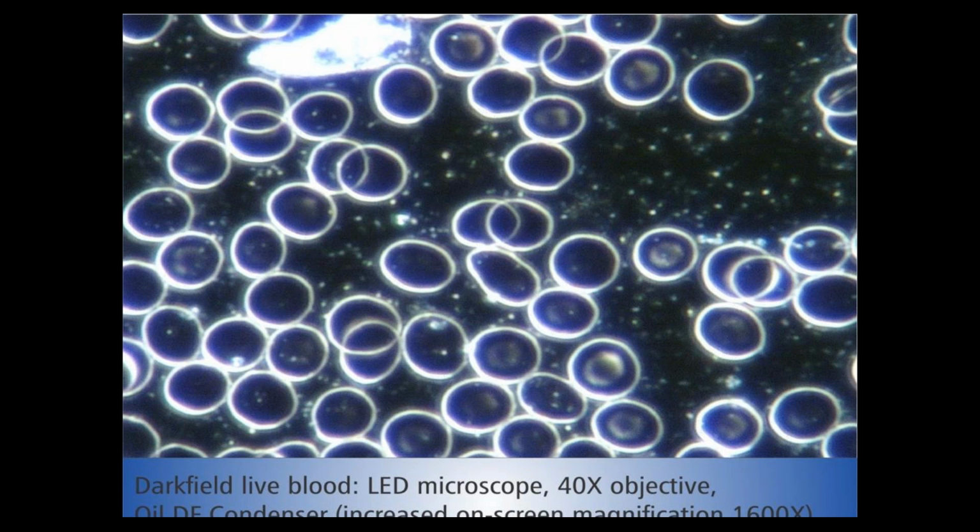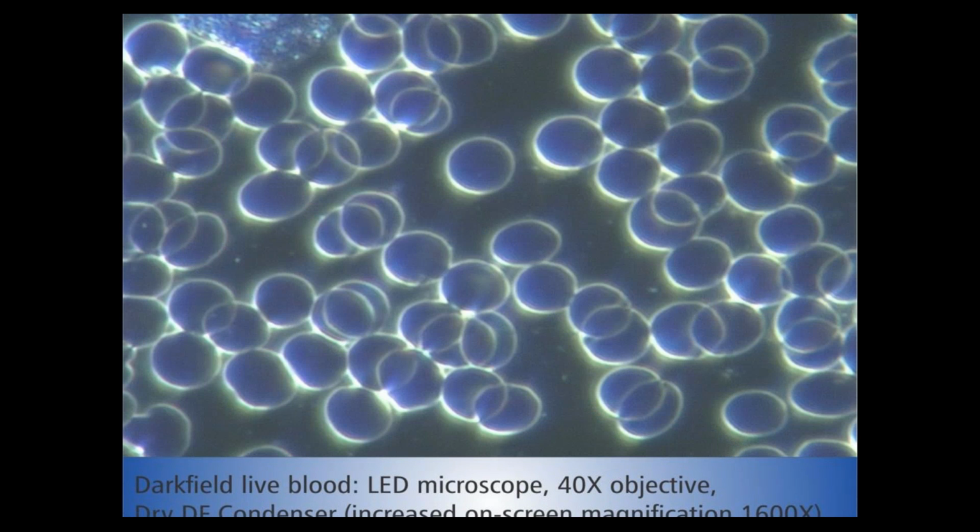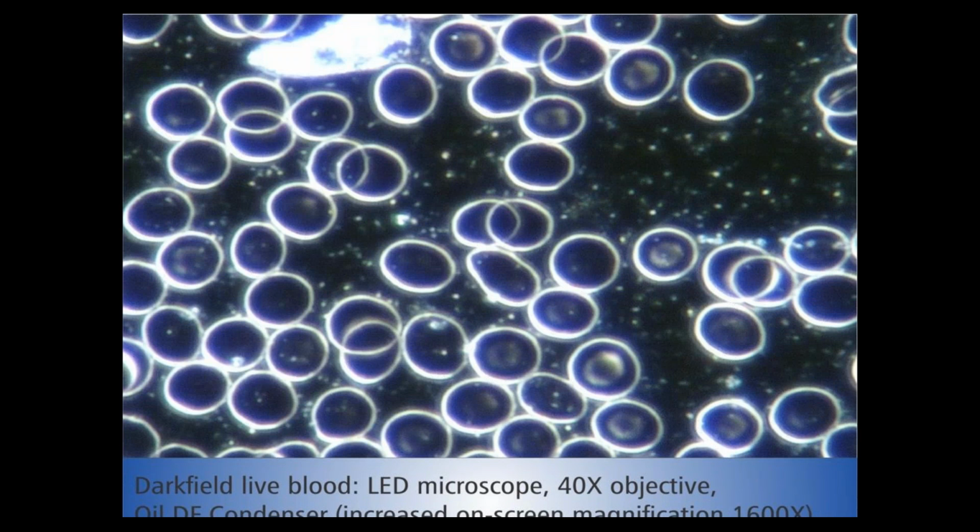And you can see with the dry dark field condenser, you're really not able to see much detail between and inside the cells. As I said earlier, this is the same blood sample, and you can clearly see that with the dry condenser we can't really see any of the target cells or many of the chylomicrons, whereas with the oil immersion condenser we can actually see target cells and chylomicrons all very clearly visible. Now, if there was anything less reflective than chylomicrons, like for example fibrin or signs of fermentation, you would not have seen it at all with the dry condenser.